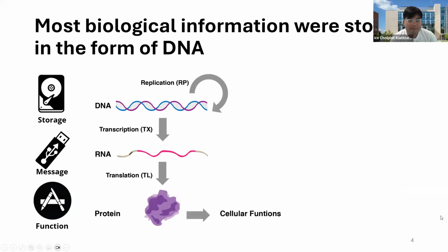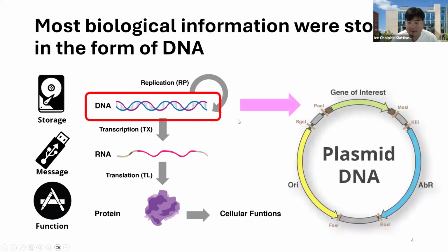All right. But the most basic thing, just in case someone just comes and watches this recording, is that most biological information is stored in the form of DNA. When you take a look at this DNA in biotech or in SynBio, we usually use plasmid DNA as our operating platform. Most of the things that are changed in this plasmid system are actually the gene of interest. Just in case there's any question about these processes, we had a previous mini lecture about plasmids.